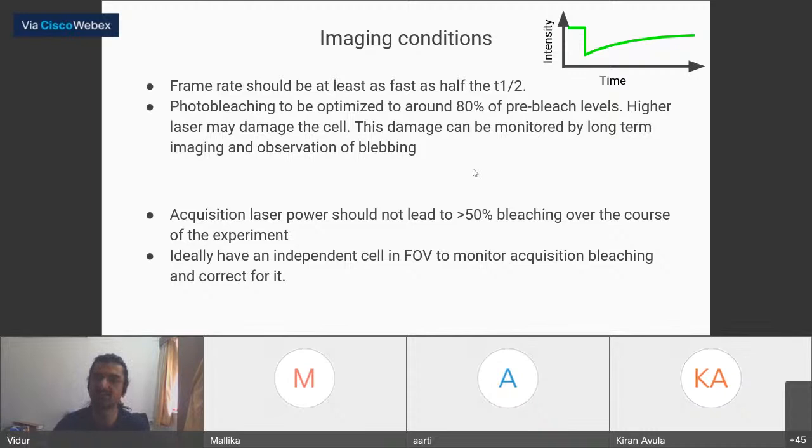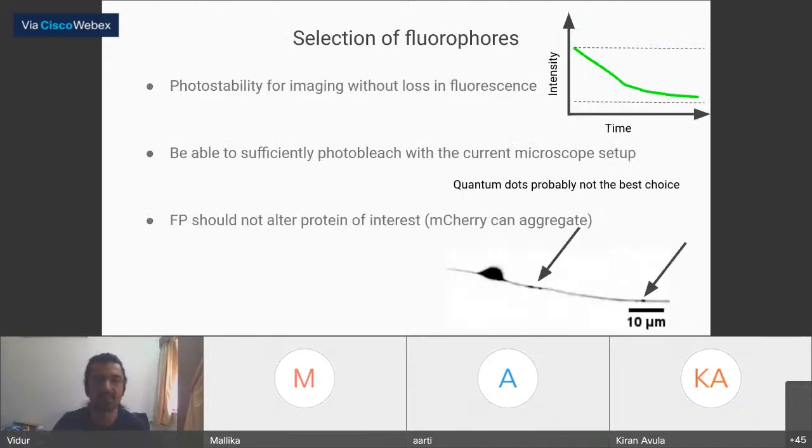So those are some things to be kept in mind while doing the experiment. I am not going to talk about the ways you tune the microscope such that your image is not saturated and such that you fill up the gray value, because I saw yesterday's lecture and they did a quite good job explaining all of that.